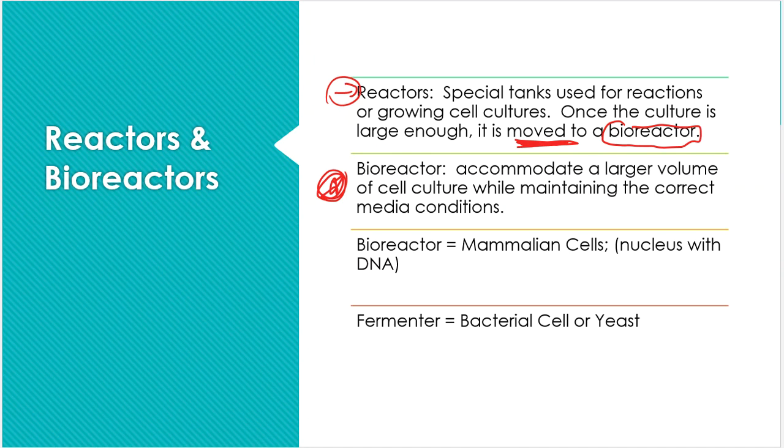And the bioreactor is what you are adding stuff to. You know your product is in there. It's going to have to be separated. It's going to have to be purified. It's going to have to be manufactured in some point or form or fashion. But the reactors are kind of like the original holding tanks. That's what those are. So reactors are growing the stuff.